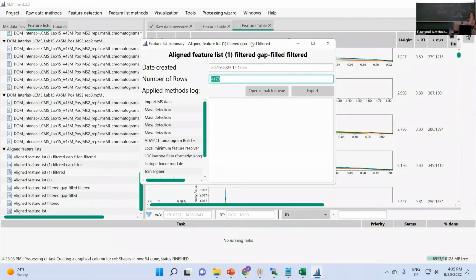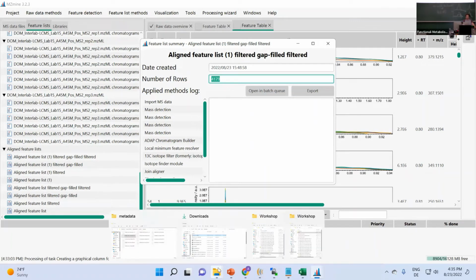So yeah, on that note, in addition to feature-based molecular networking, which is where all of this leads up to, what I typically recommend, especially if you're starting, is to also just run a classic molecular networking job. That has to do with checking what MS/MS spectra are in there and what compounds I can ID by only looking at the MS/MS without any chromatography, deconvolution and whatsoever.